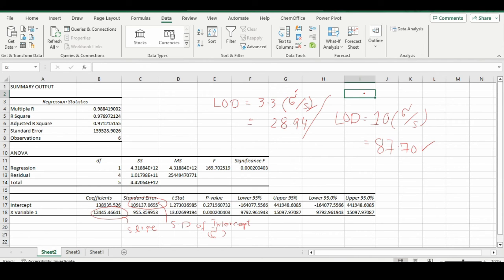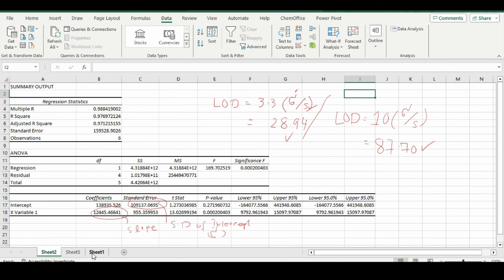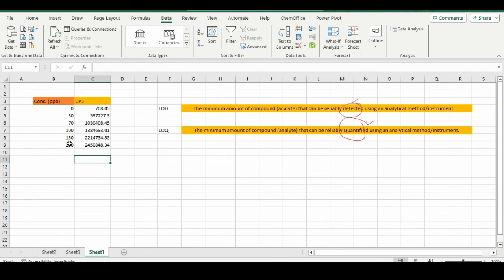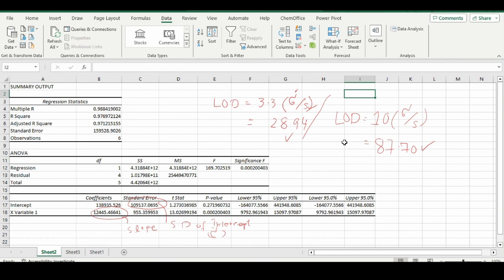Why am I talking about ICP-MS? Because these values are derived from ICP-MS. This is the concentration in parts per billion and this is the CPS value, counts per second. These are my minimum values: 28.94 and 87.70. In this way, we can find out the limit of detection and limit of quantification. If you have any questions, you can ask in the comment section.